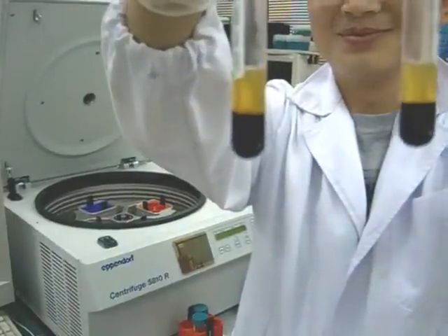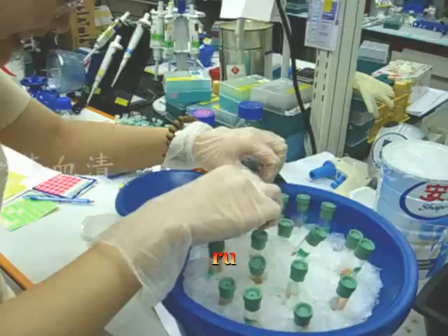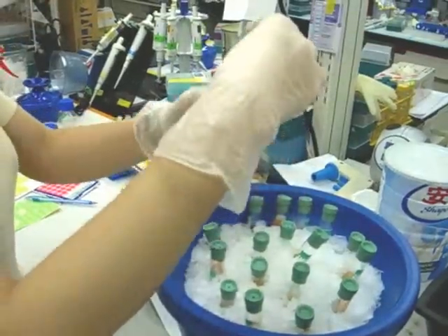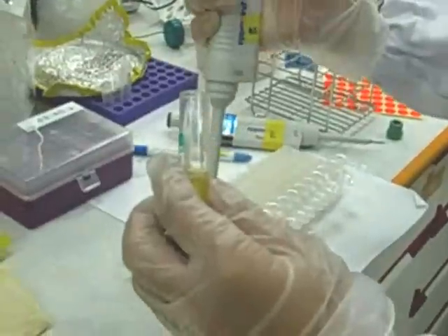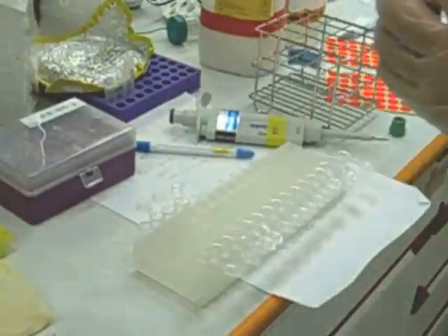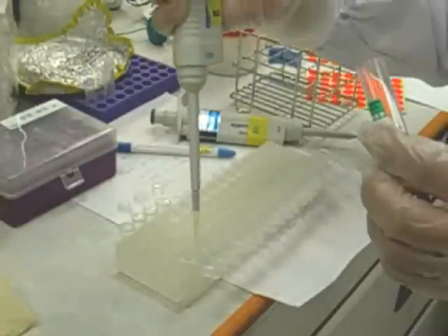After centrifugation, draw out the separated serum and blood cells. Then, use a high-speed centrifuge to further separate the serum samples. Store the separated serum samples individually in vials.